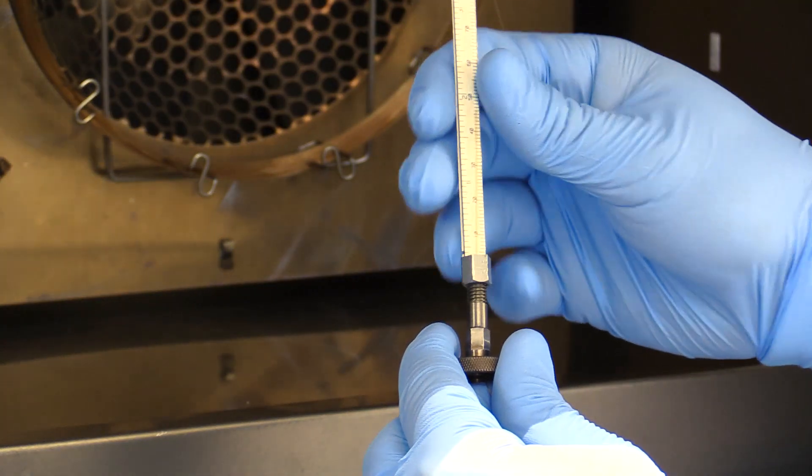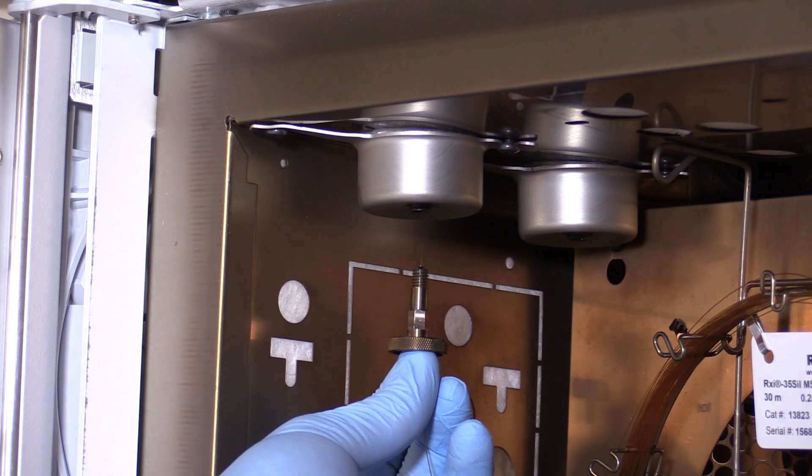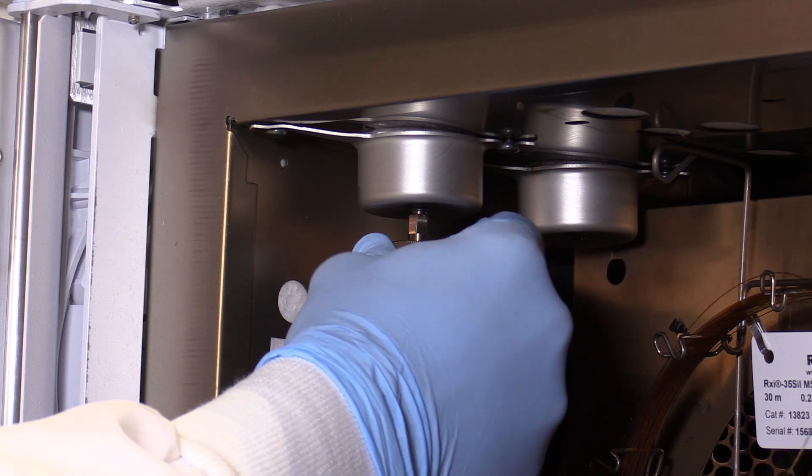Using an installation guide, set the column length to the appropriate depth for the inlet. This depth can be found in your instrument manual. Once we have the correct depth set, tighten the column nut to the inlet reducing nut so that the column is set firmly in the inlet.